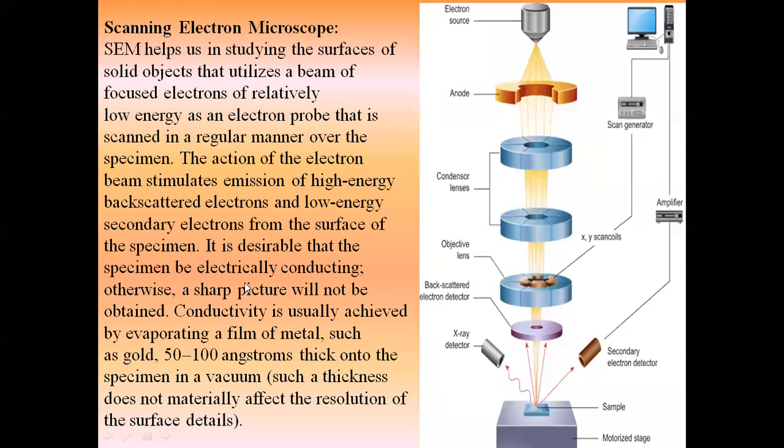Ultimately, while we are making the samples ready for the electron microscope, there is one important point to be noted: the electron microscope will never be used for your living cells. Living organisms cannot be scanned in the electron microscope, because of how the sample is made ready.